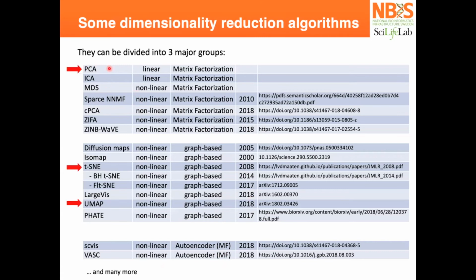Today I'll talk mostly about PCA, which is very, very well used. Here, for example, I can see ZINB-WaVE, which was already mentioned, so it's also considered a way of dimensionality reduction. TSNE and UMAP are also the most used ones. TSNE is now falling into disuse and is being replaced by UMAP, but both are still quite widely used in the literature to this day.